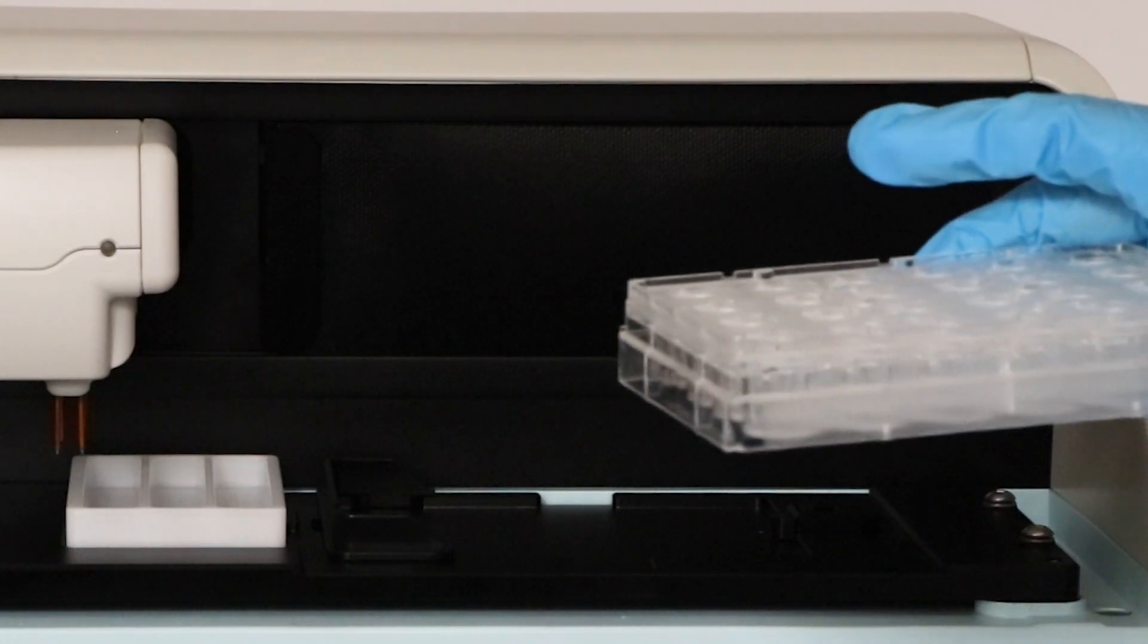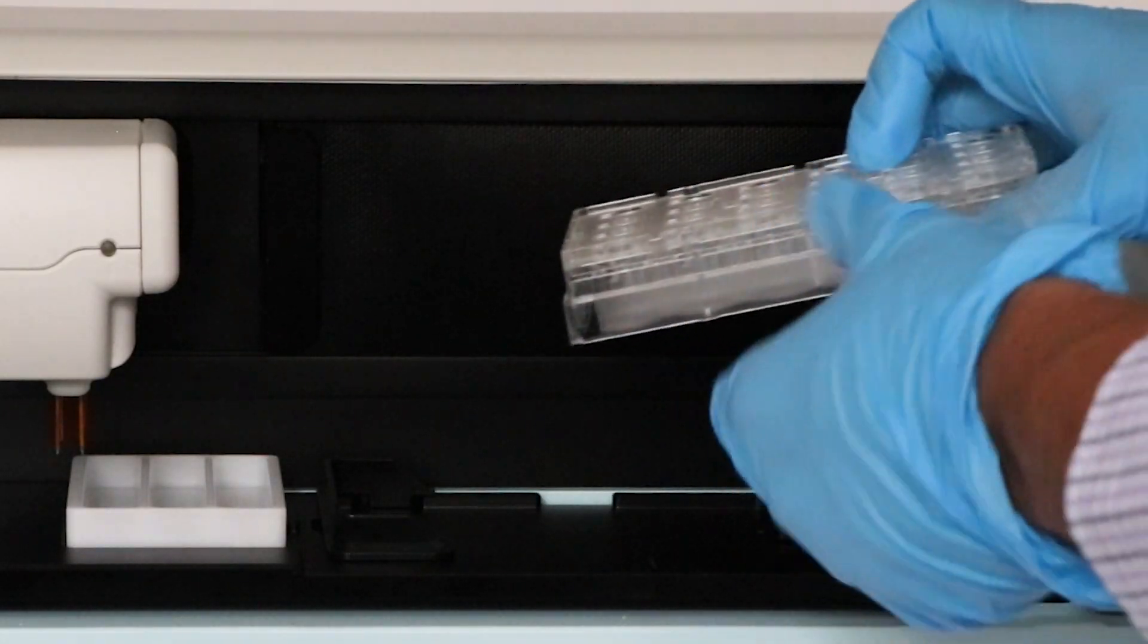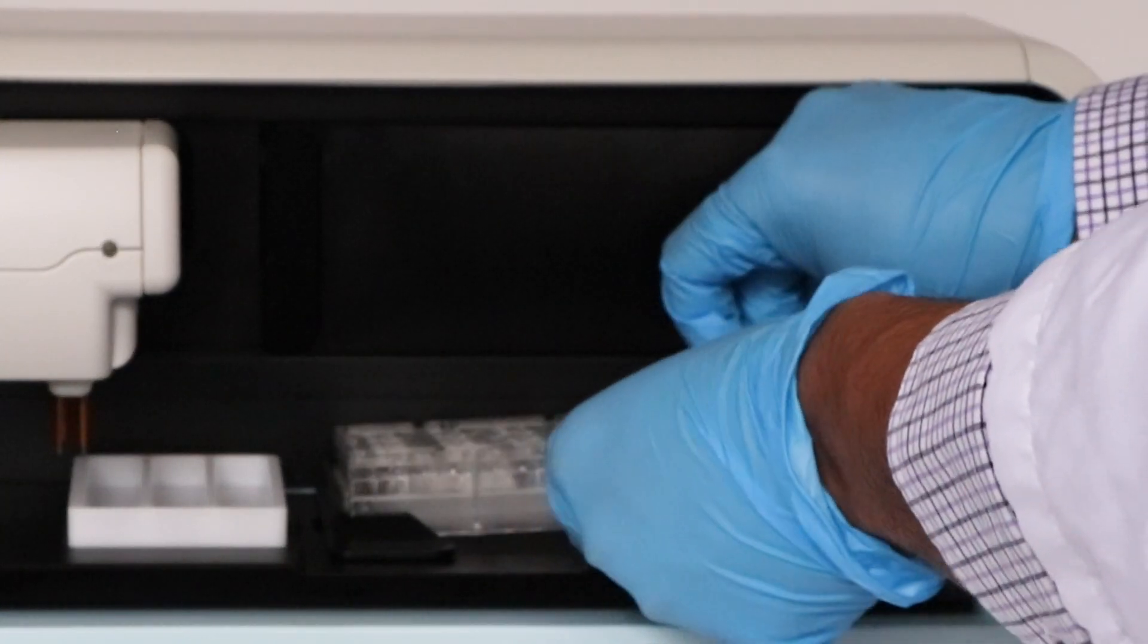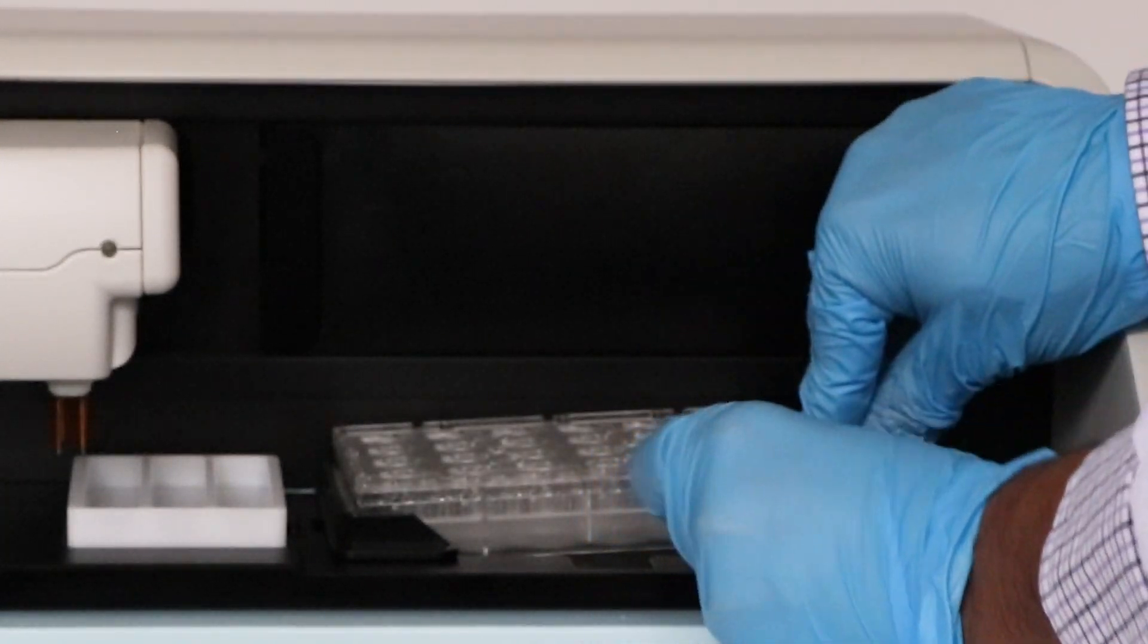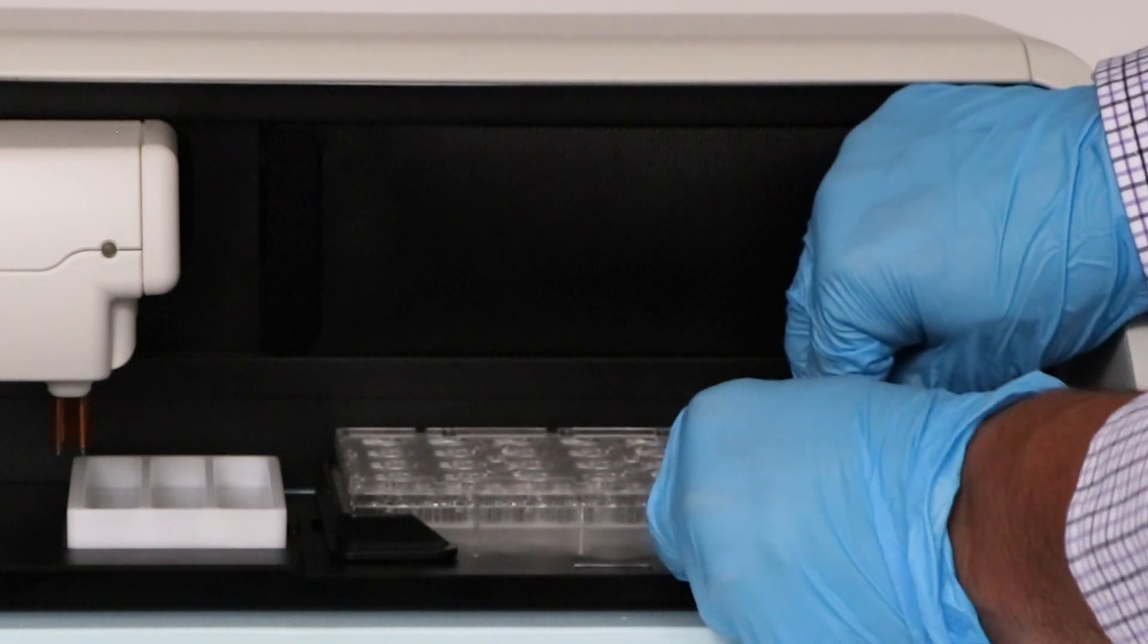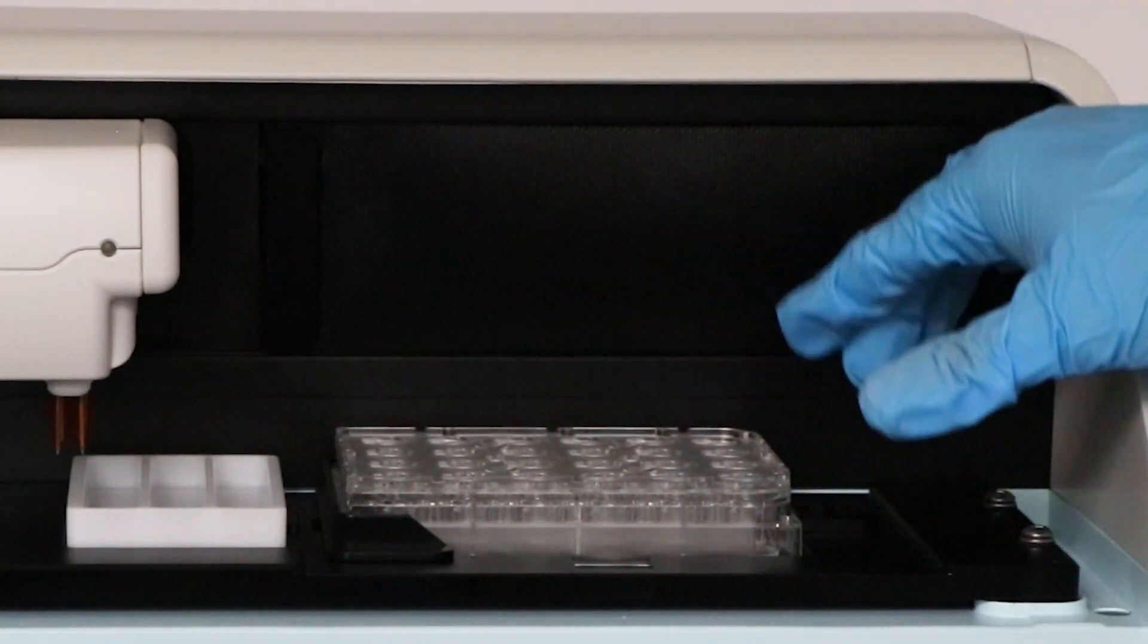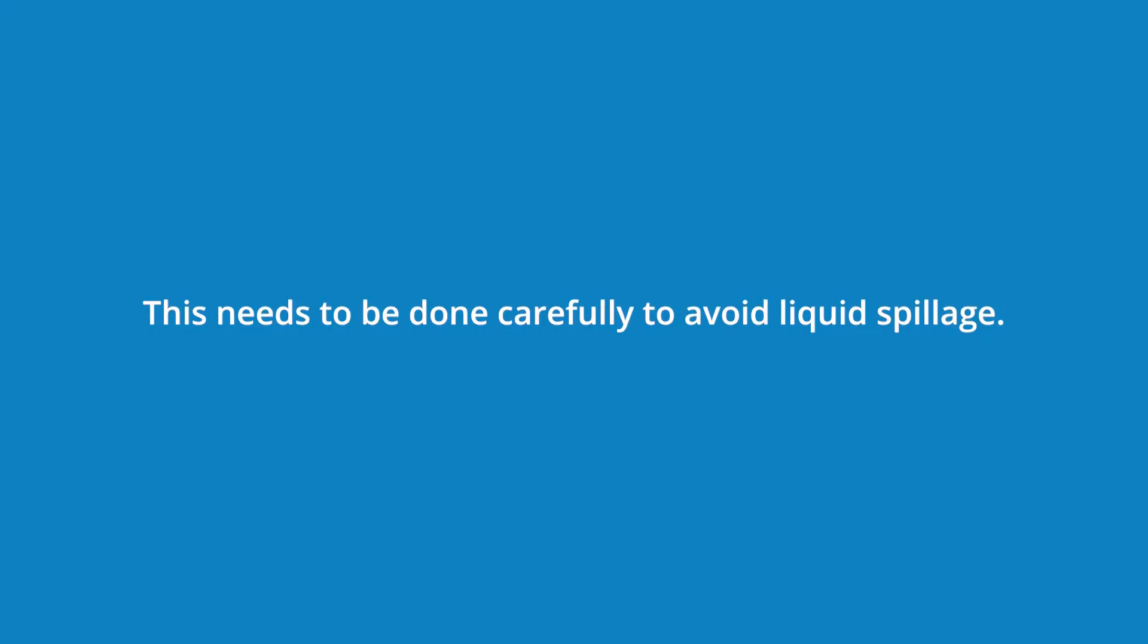Install a Corning 24 HTS plate in the plate measurement area. Position the A1 corner in the top of the plate positioner. Then pull the spring mechanism of the plate handle from the other side and let the plate down gently from the other side. This needs to be done carefully to avoid liquid spillage.